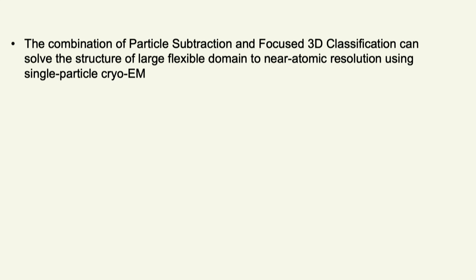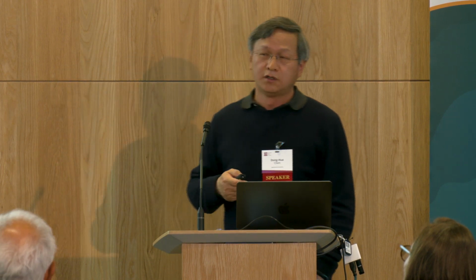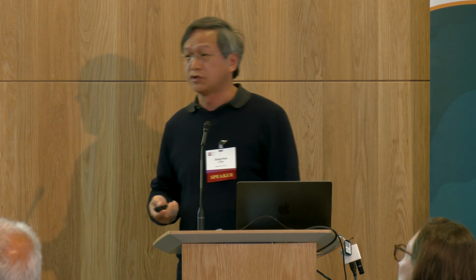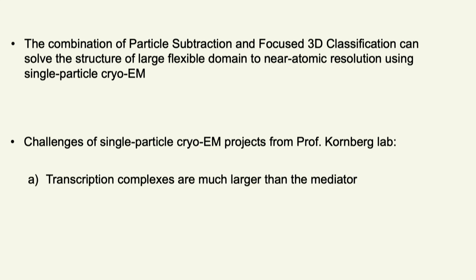So in Kornberg Lab, we are trying to understand how transcription is regulated, and we are using single particle cryo-EM to understand how these transcription components interact with each other. But there are some challenges for these single particle cryo-EM projects. First, these transcription complexes are huge compared to Mediator. Mediator is about 1 megadalton, while some complexes we are working on are about 7 to 8 megadaltons.